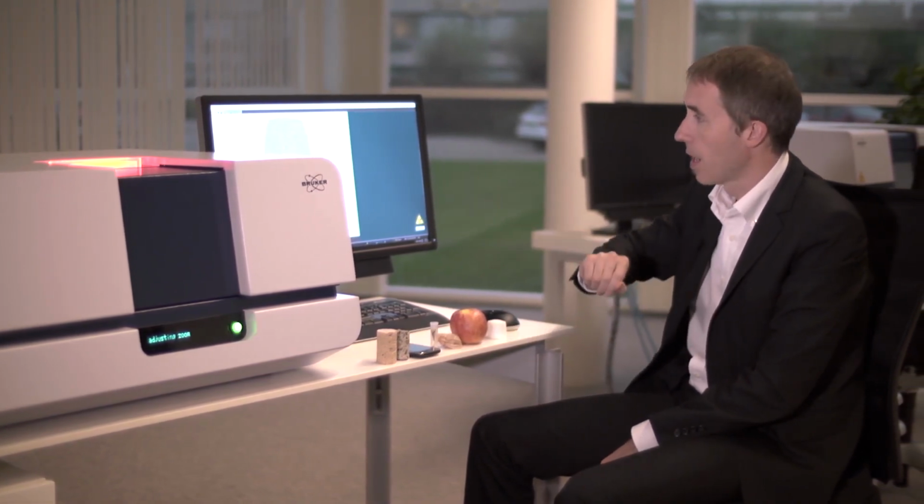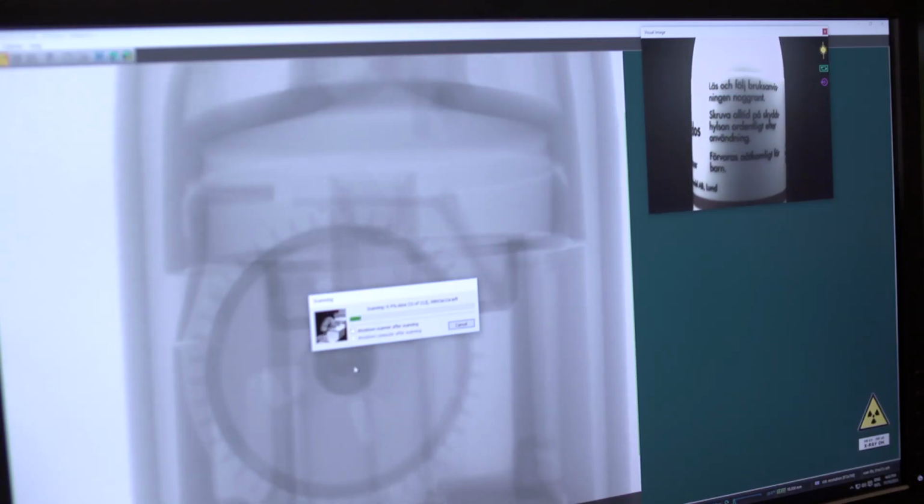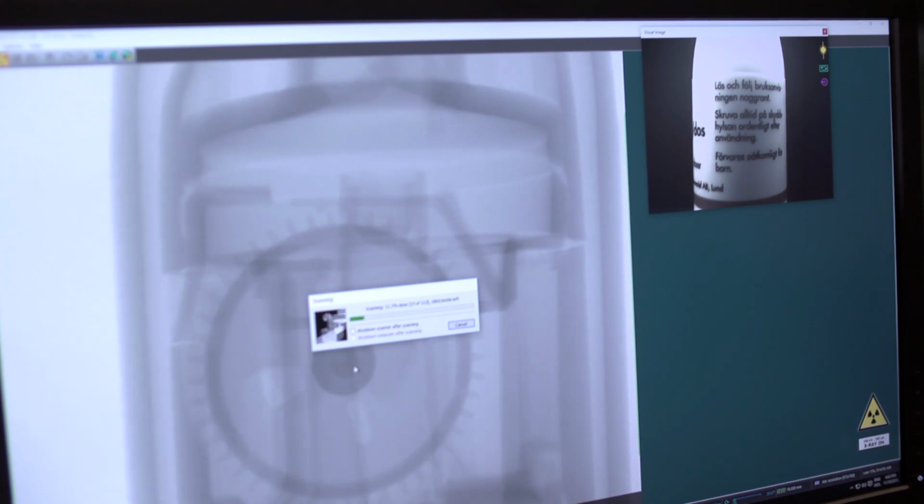of the nice features of this scanner is that it will automatically detect the size of the object. And by rotating at different angles, it can look for the maximum diameter of the specific object that you have placed inside, and it can zoom in to the maximal desired resolution. Once it's done that, it will actually start the scan by acquiring projection images over multiple angles.